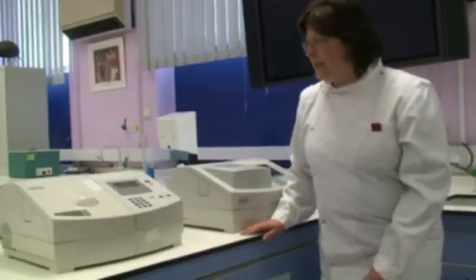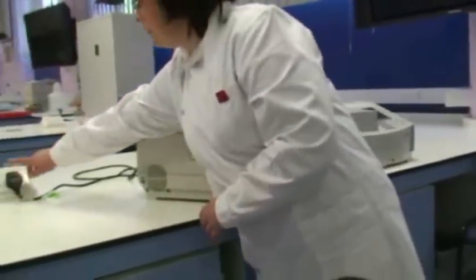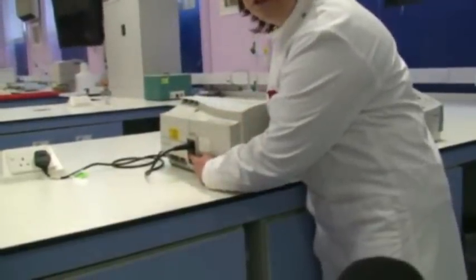Before starting your experiment, you need to make sure to check that the spectrophotometer is switched in at the mains. And also, you need to switch on the button at the back of the machine.